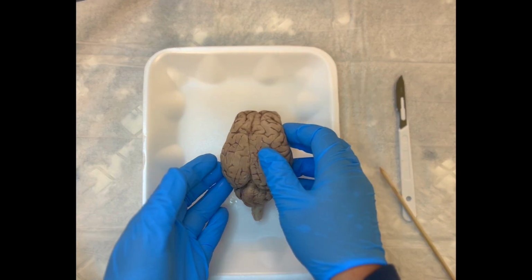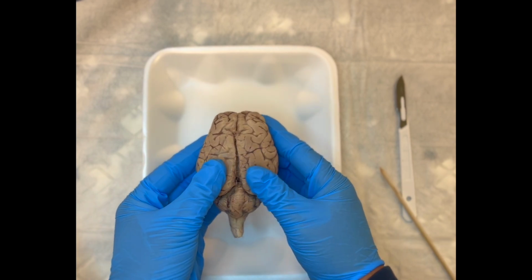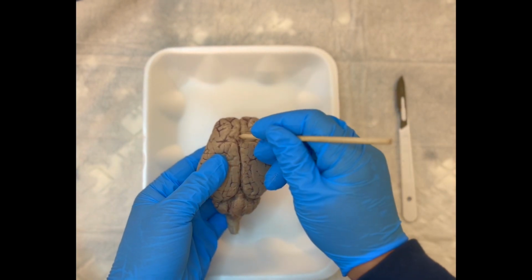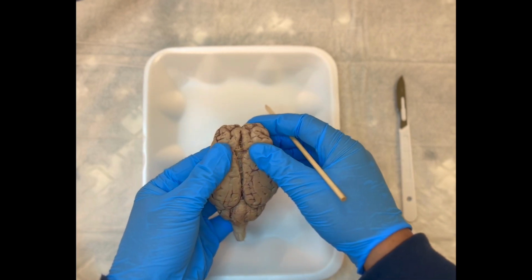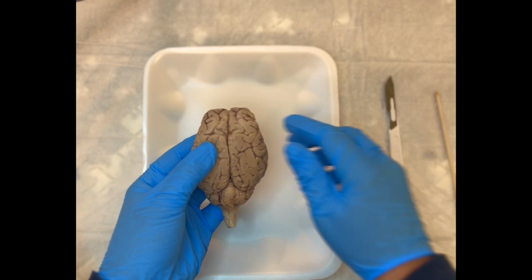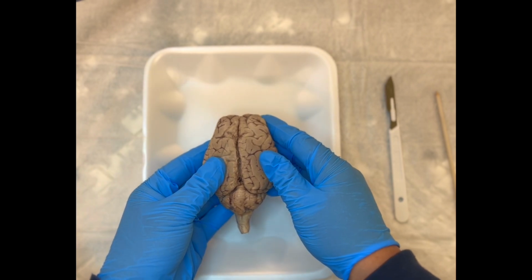So you can pick your brain up, you can kind of use your hands and separate those two halves, and you will realize there's quite a narrow cavity there. You can even use your wooden probe if you need to separate the tissue a little bit to see in there a little better. You could use your scalpel blade at this point, but you don't want to get too carried away. The best tool during a dissection is your own hands.